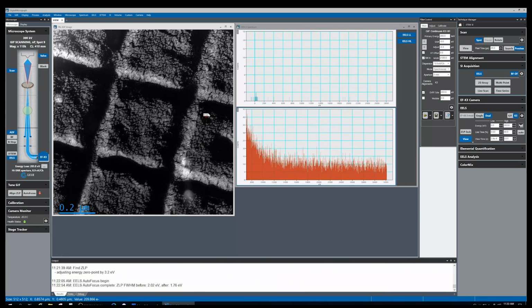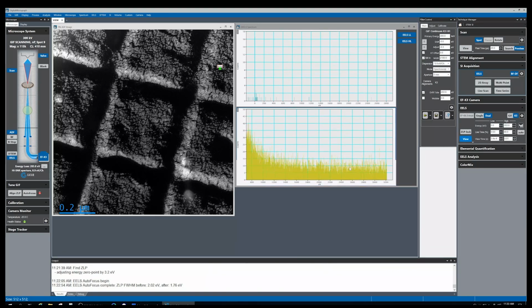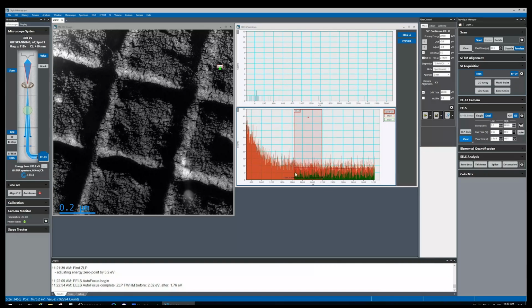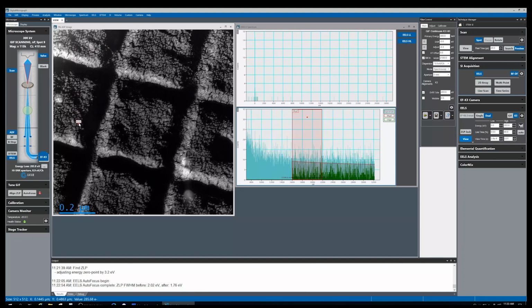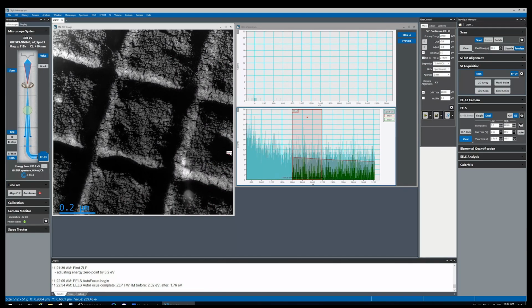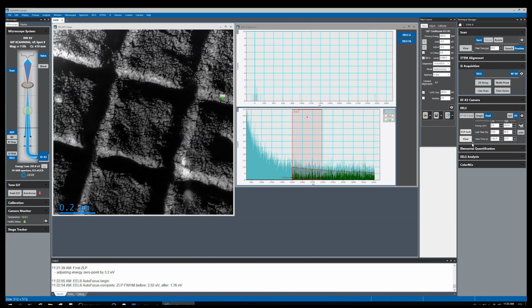The gold M edge is going to appear around this region. So we can hold the shift key and drag the mouse on this live spectrum so we get a live background correction. It feels like there is some signal, so maybe we can give it a try with this setting.